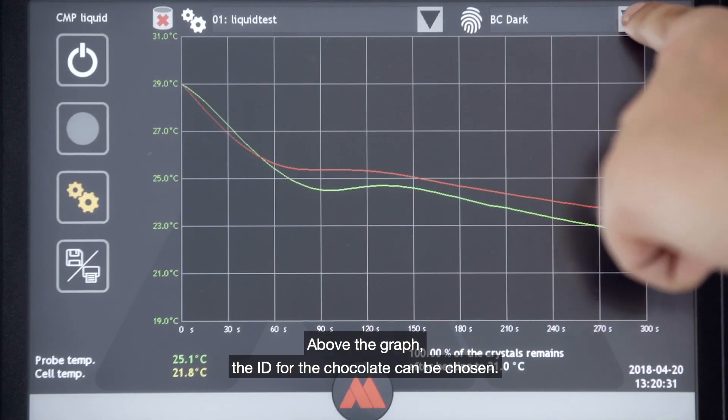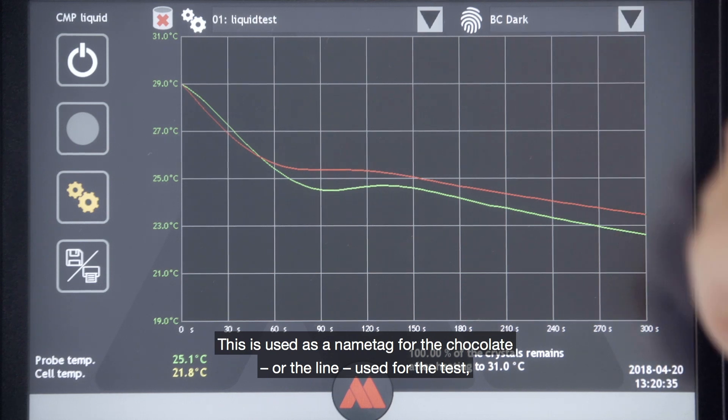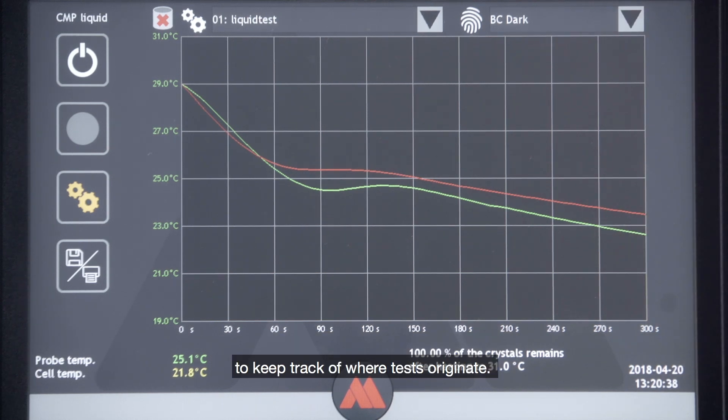Above the graph, the ID for the chocolate can be chosen. This is used as a name tag for the chocolate or the line used for the test to keep track of where the tests originate.